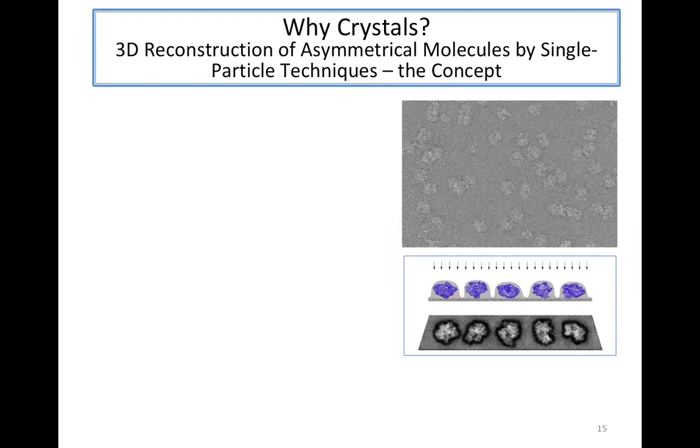It was the idea to make use of the fact that in solution, the molecules are completely randomly arranged. And so if you take a snapshot of these, then you get with high probability the entire angular range of randomly oriented views.